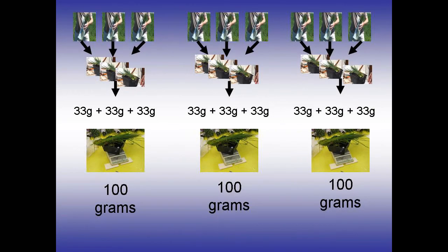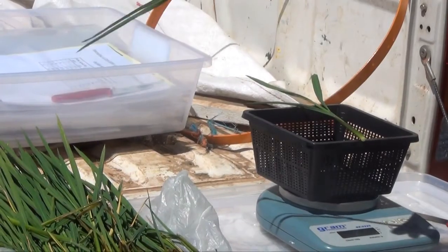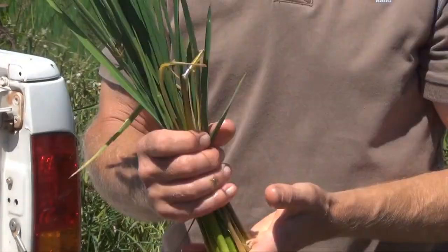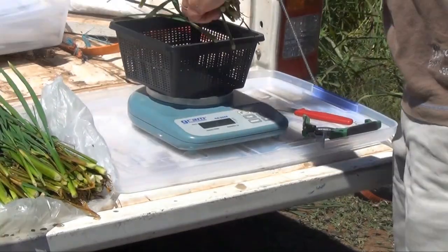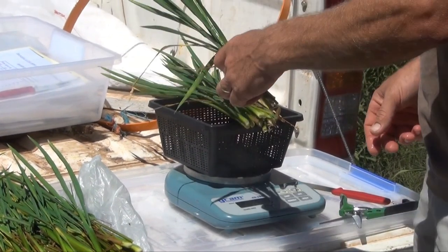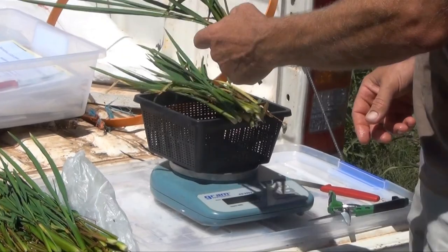The next step is to prepare a subsample for the NIR analysis. Three subsamples of around 100g each are required from the nine field samples. Grab a little bunch — that's representative, it's got the dead leaves and stuff like that. Stick that on top; that's about 50g, so take a few off to make it around 35g.